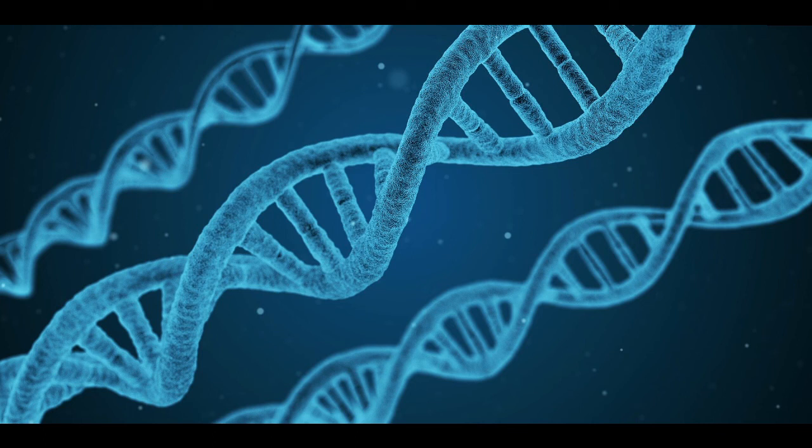And you just try it again, and maybe you lower the temperature, or you do the DNA extraction again. Maybe it was a little dirty, maybe you had inhibitors. So PCR can fail regularly. It sounded like one of the things you were working on, Megan, with our DNA group was that there would be other regions or other primers to use. Can you talk a little bit about what that is and why we would be doing that?